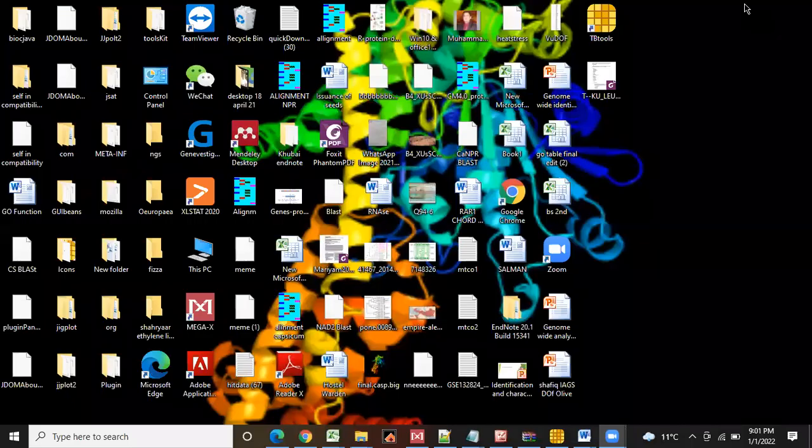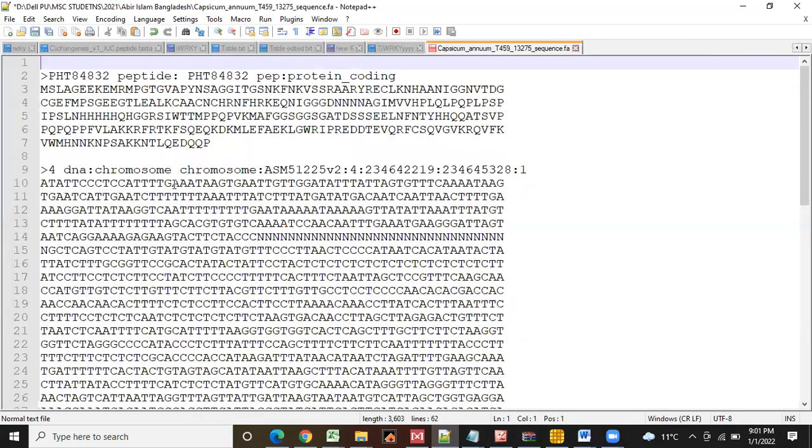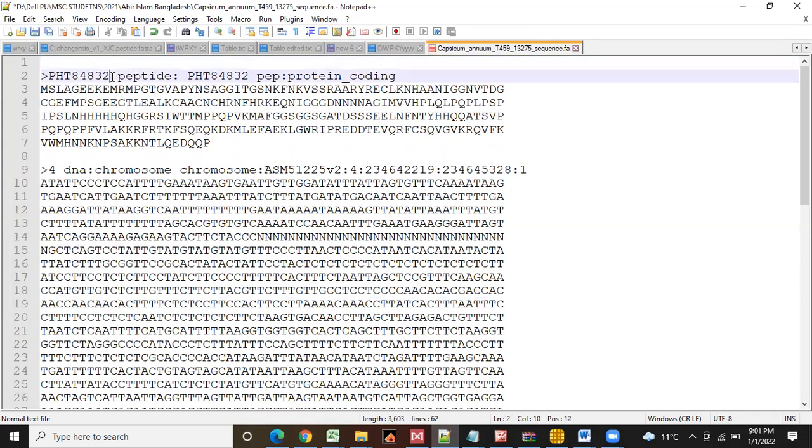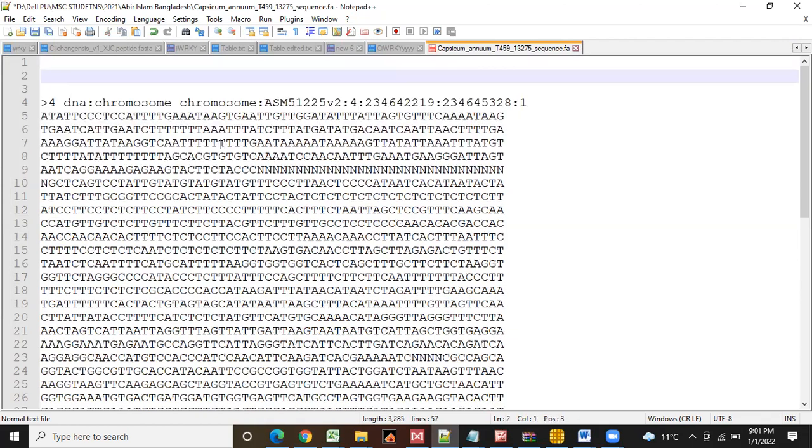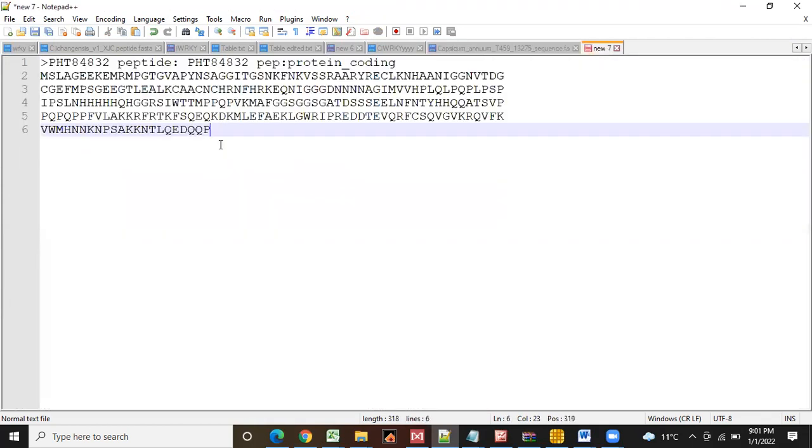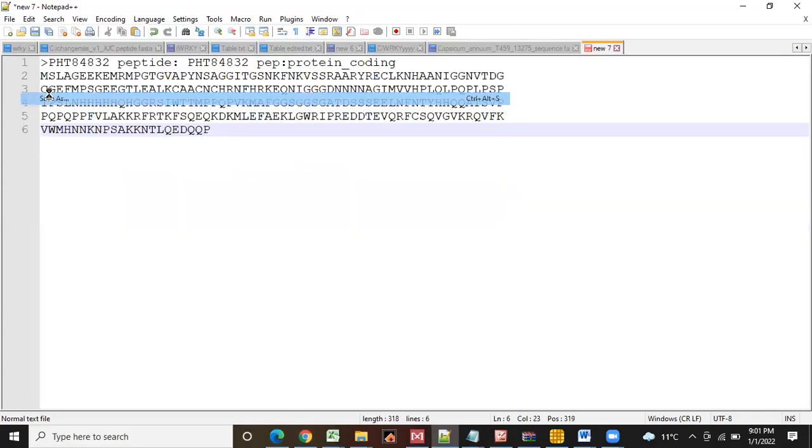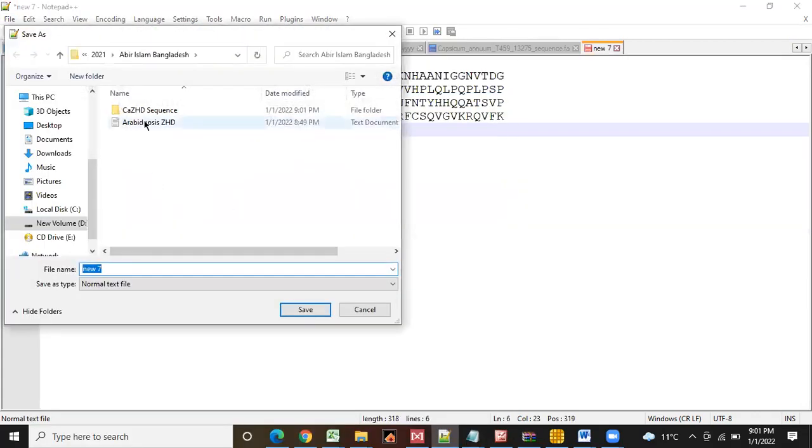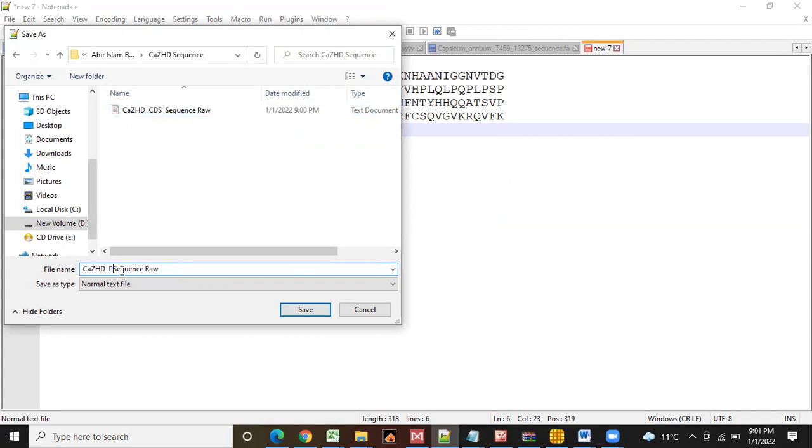Now you will go again. Now it's a peptide sequence. Now you will cut this, Control N, Control V. And you will save this as - save as - peptide sequence, peptide raw.